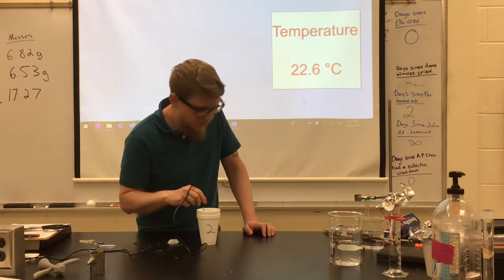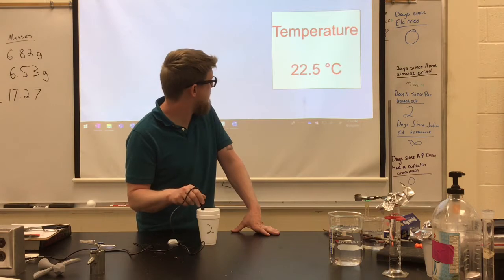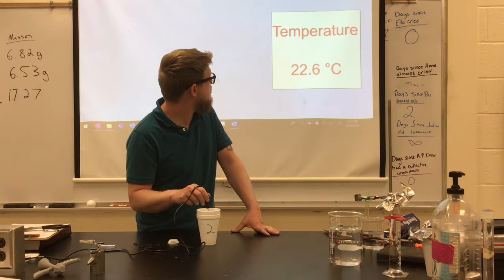Okay guys, that dissolved pretty quickly. It looked to me like the minimum temperature here, oh, it's going down a little bit more. Maybe 22.5, let's see if it goes down any more, if that's the minimum temperature. Okay, yeah, it looks like about 22.5 is the minimum temperature.